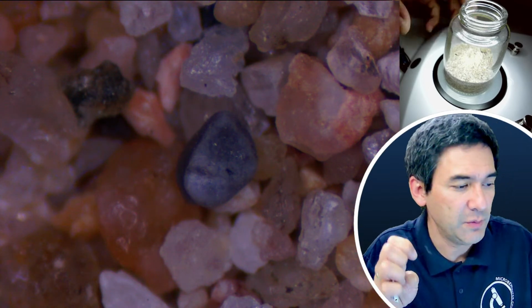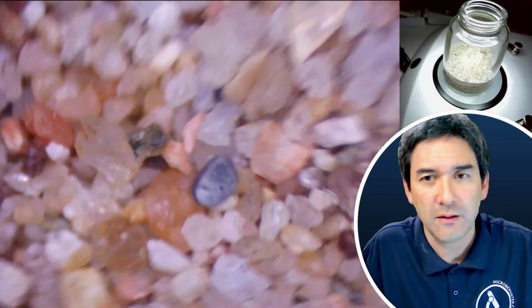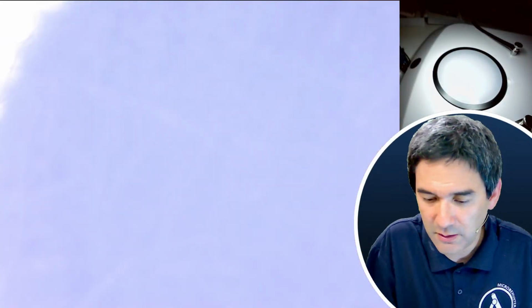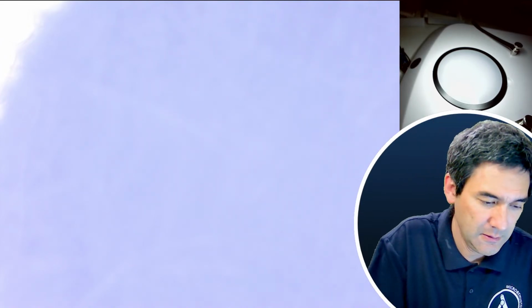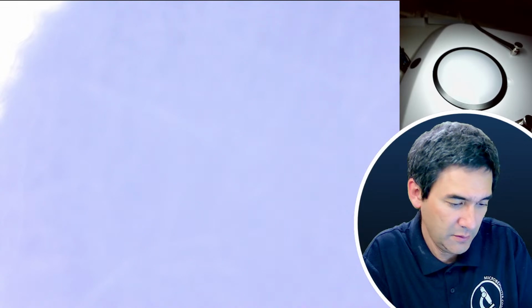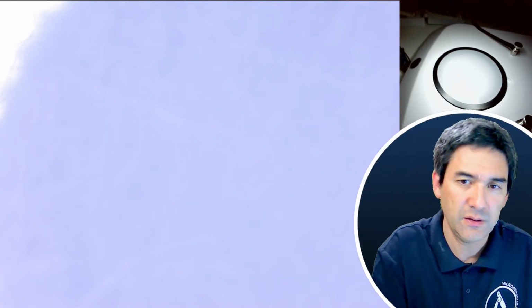Right? So this was a sand from Cannes, southern France. Okay, and let's always close it again. This one is quite interesting here as well. Where is this one from? Yeah, Crescent City. I think this is in California. Somebody took it, yeah.